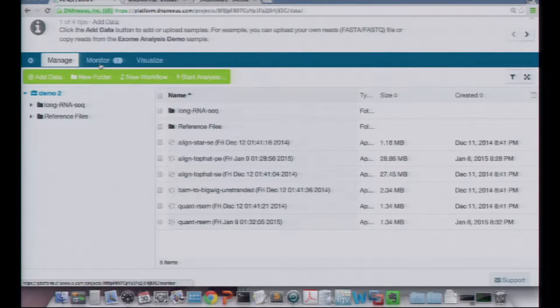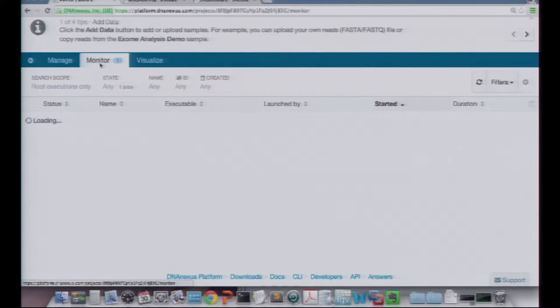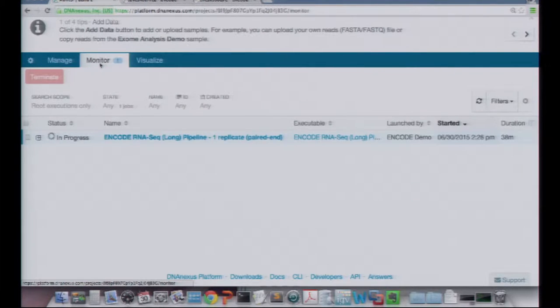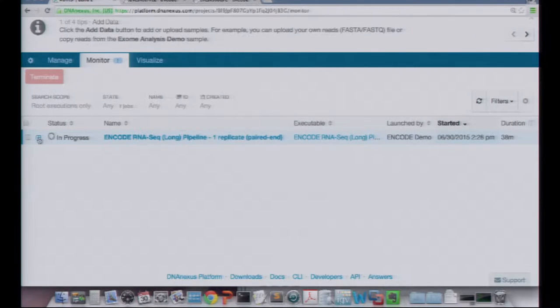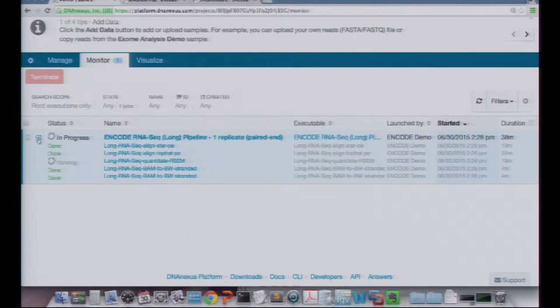I'm going to reload that. So if you go to here, you can see it's been running for 38 minutes, so actually it might be done. Indeed.